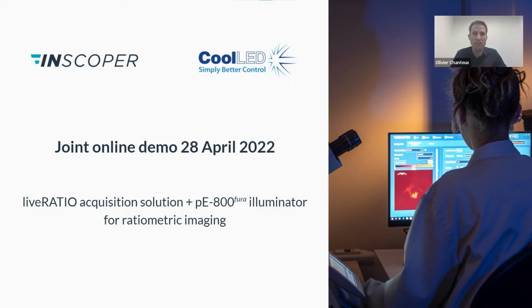The acquisition you will see was performed on a microscope at the Microscopy facility of the University of Nantes, France, which also prepared the live samples for us. I would like to deeply thank them for their welcome and support.